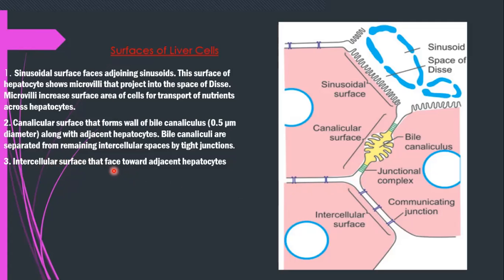Then you have the intercellular surface that usually faces toward the adjacent hepatocyte, like this over here. This is an intercellular surface. Okay.